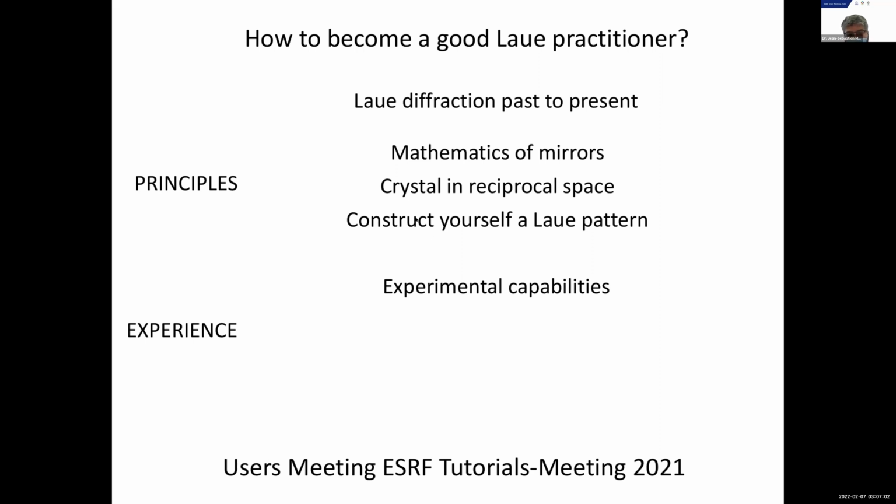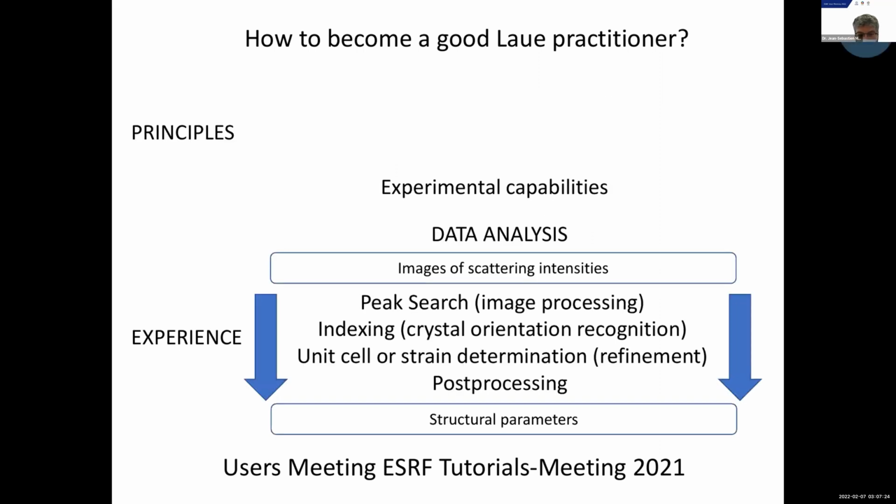And so you will be able to construct a Laue pattern yourself, on your own computer, if you want to. And then I will also show you the current experimental capabilities on the beamline, and also on the beamlines in the world for the Laue diffraction technique.